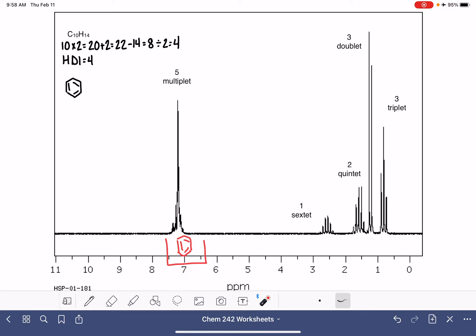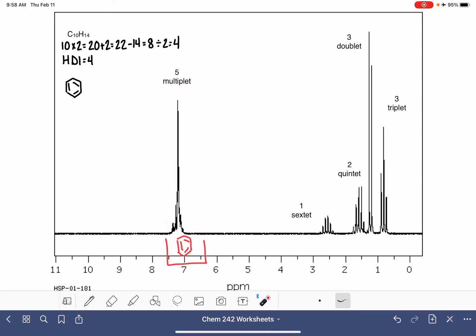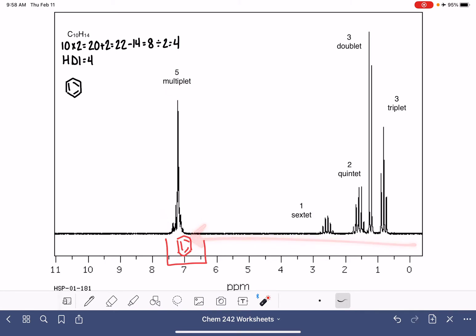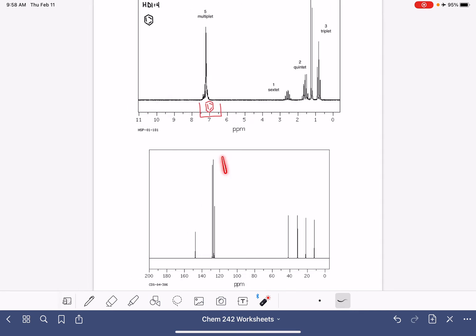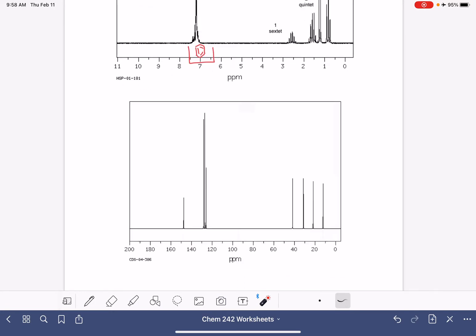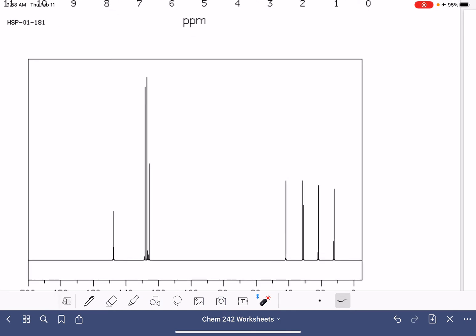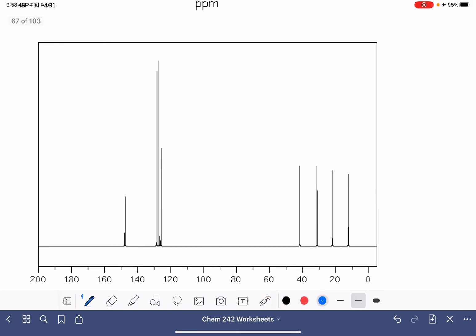Also, if we have a benzene ring, we should see peaks for those carbon atoms in the same general area of the spectrum. So if we go down to the carbon NMR, we can see we've got peaks right here. These peaks are also going to be corresponding to benzene — they're in the same general portion of the spectrum.